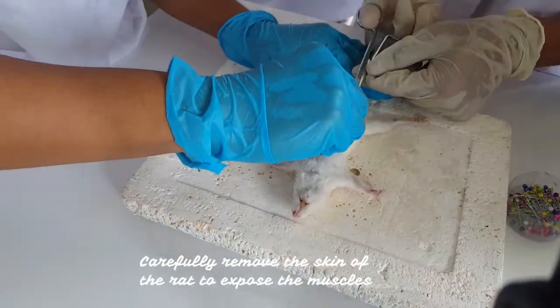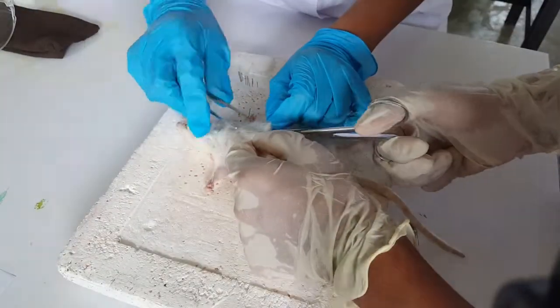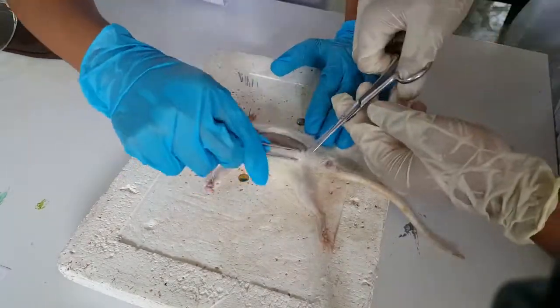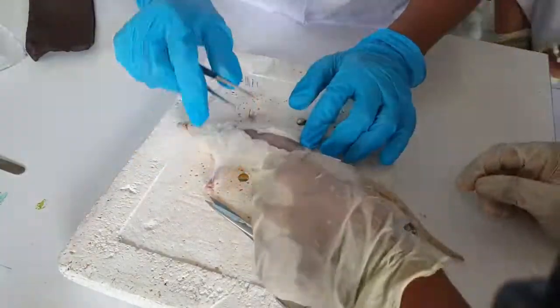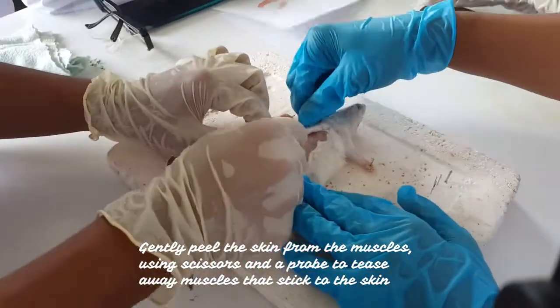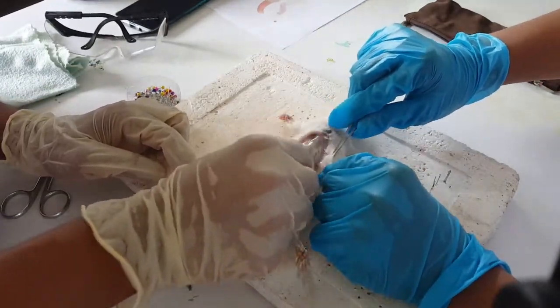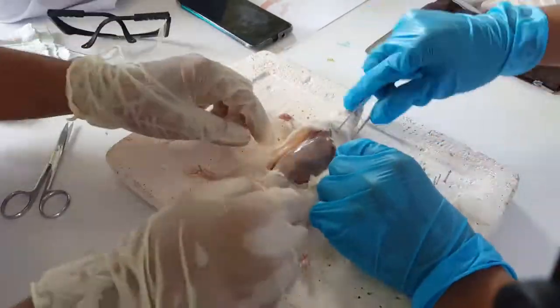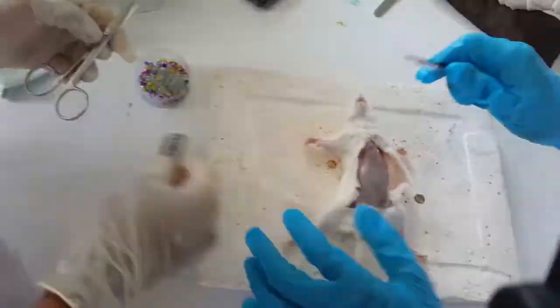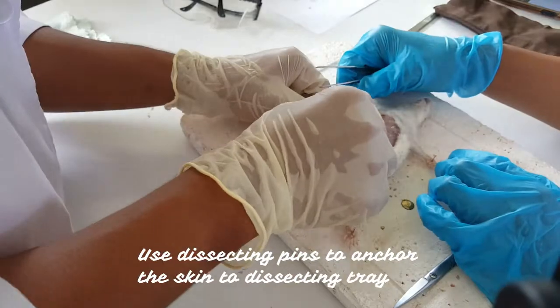Carefully remove the skin of the rat to expose the muscles. Gently peel the skin from the muscles using scissors and a probe to tease away muscle that sticks to the skin. Use dissecting pins to anchor the skin to the dissecting tray.